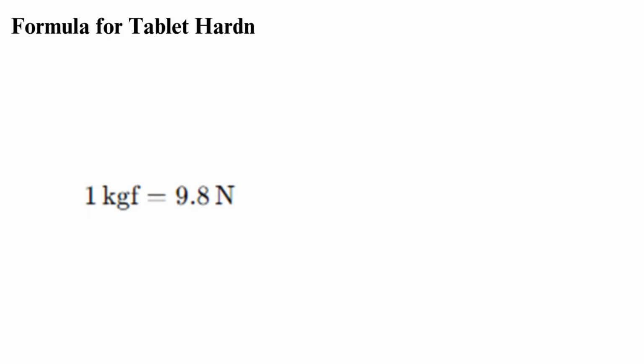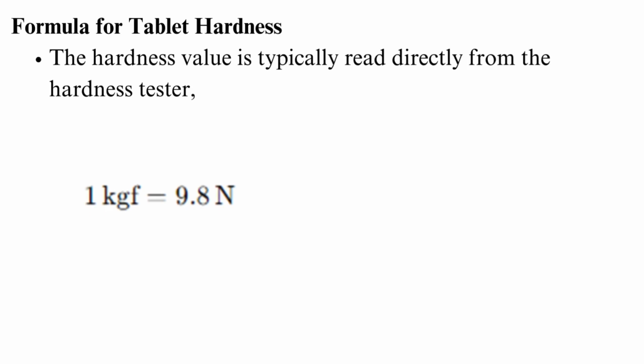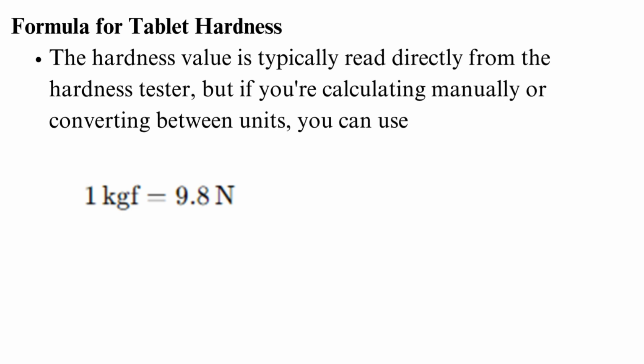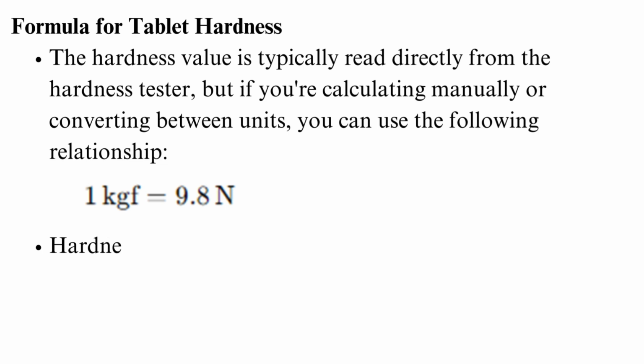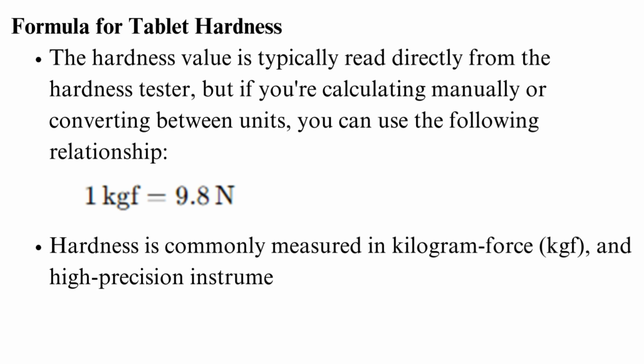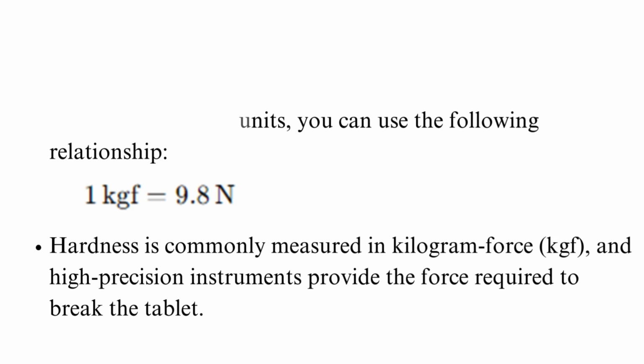Formula for tablet hardness. The hardness value is typically read directly from the hardness tester, but if you're calculating manually or converting between units, you can use the following relationship. Hardness is commonly measured in kilogram force, and high-precision instruments provide the force required to break the tablet.